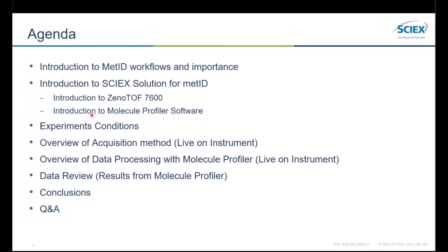And then we're going to talk about the experimental conditions, pretty generic conditions that I use for MetID experiments, with an overview of the acquisition method and the data processing with Molecule Profiler. Both will be live on the instrument PC. And then we'll have a data review with the results from Molecule Profiler. And we'll close the class today with the conclusion and some Q&A at the end.